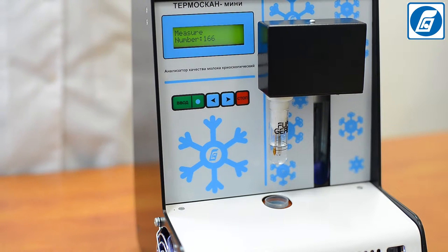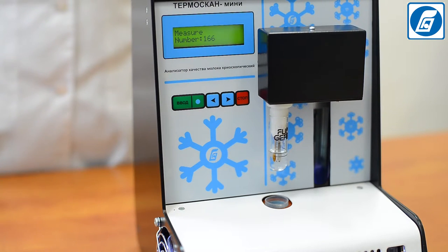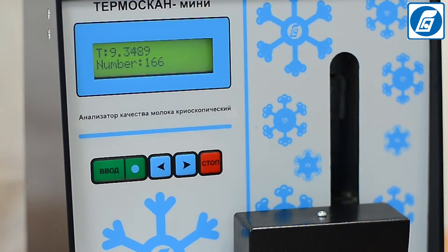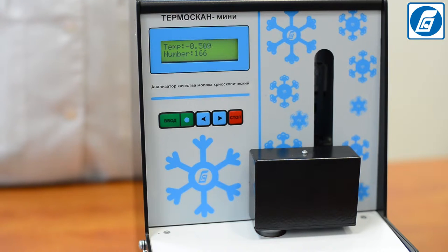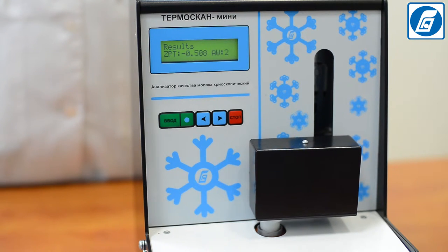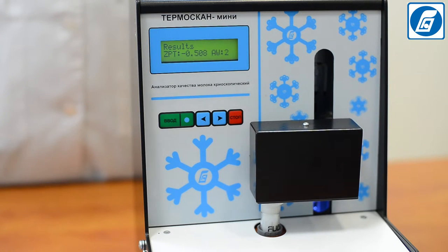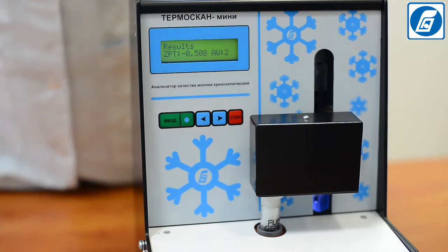Insert the test tube with standard solution into the sample receptor of the analyzer's cooling bath and press Enter. The cooling process begins and the sample temperature is displayed as it decreases. The sample is first cooled below the freezing point, then freezing is stimulated by a hushing wire striking the test tube walls. After crystallization begins, the temperature quickly rises and remains practically constant before falling. The freezing point — the highest temperature reached in this period — is automatically fixed and displayed.